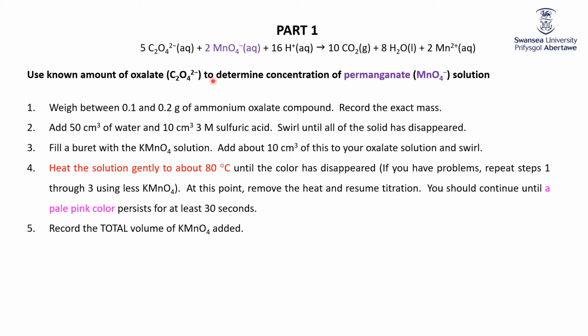Now, don't worry about understanding every little step that we did here, because as you know, anytime you do an experiment, a lot of times you don't quite get the hang of what's going on until you actually do it. So now what I'm going to do is do each of these steps, showing you how I did it in the lab.